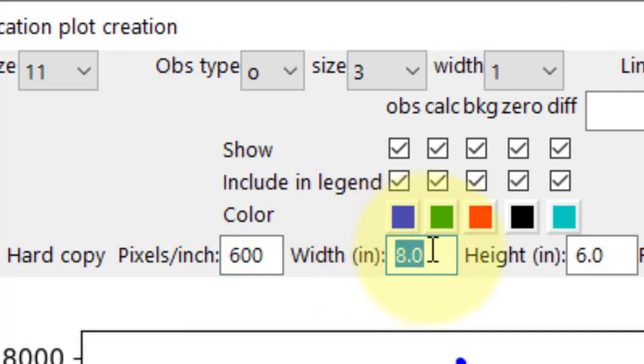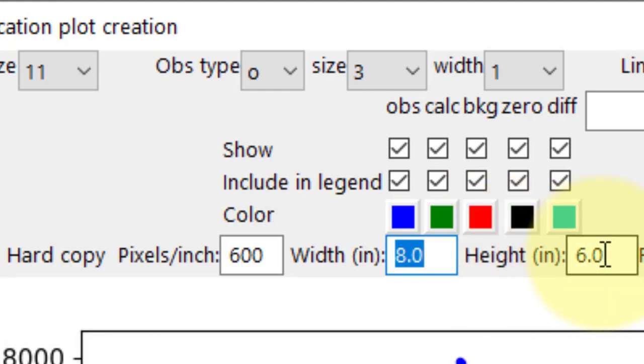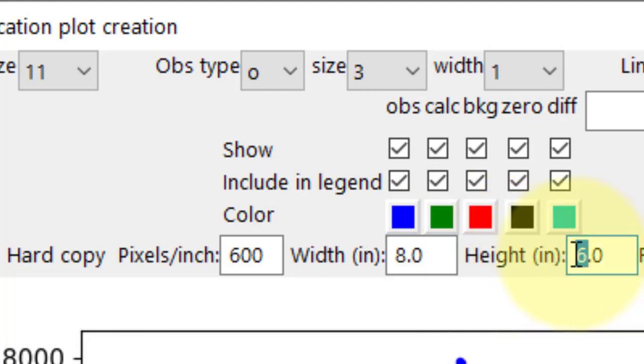We can set the width and height of the figure, such as 8 by 8 inches for a square plot, or the default 8 by 6 inches.